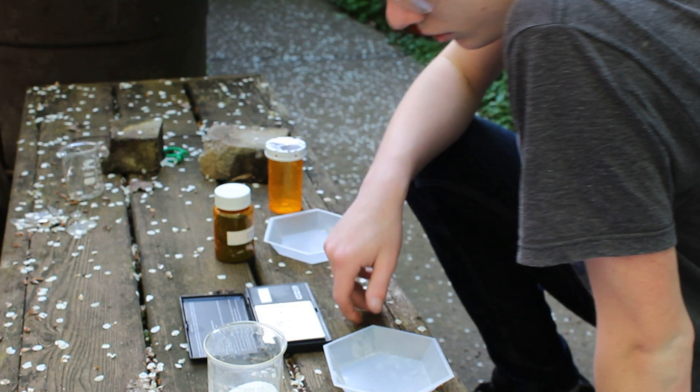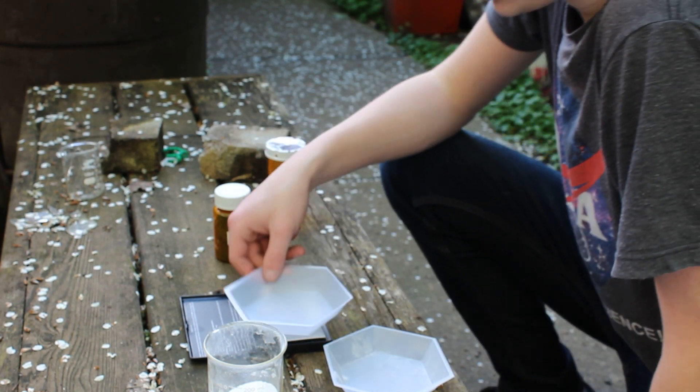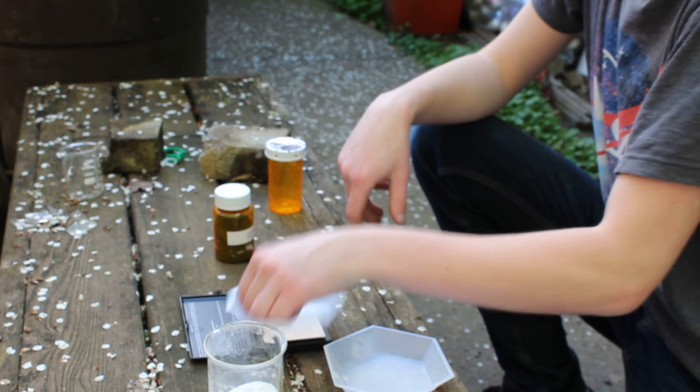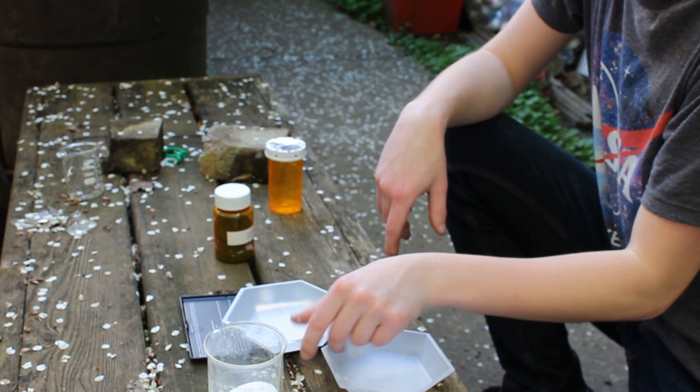Hey, it's Harrison, and in today's video we're going to be making sodium dichromate. Word of caution: sodium dichromate is carcinogenic, which means it causes cancer, so don't try to make this at home.